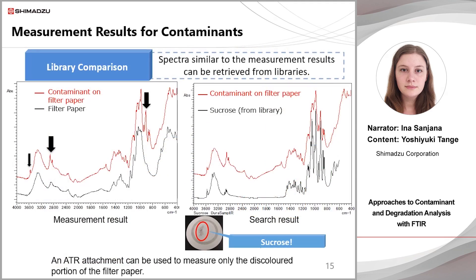These graphs show the results of measuring a contaminant on filter paper. The spectrum of the discoloured area of the filter paper is compared to the spectrum of clean filter paper. The arrows indicate differences — these peaks are not present in the normal filter paper spectrum. By searching in the library, a match was found and the contaminant was identified as sucrose.